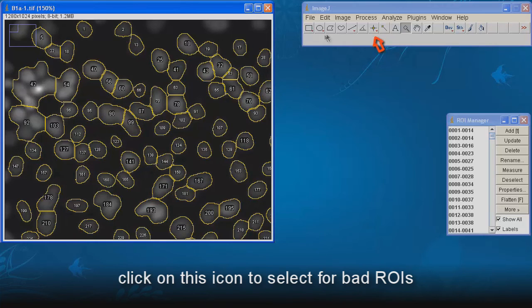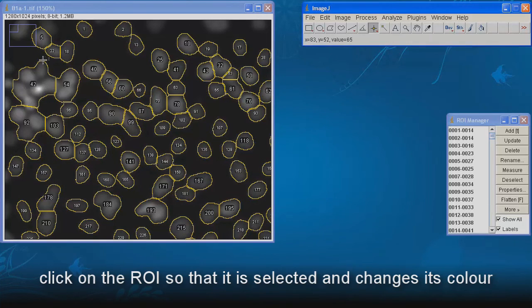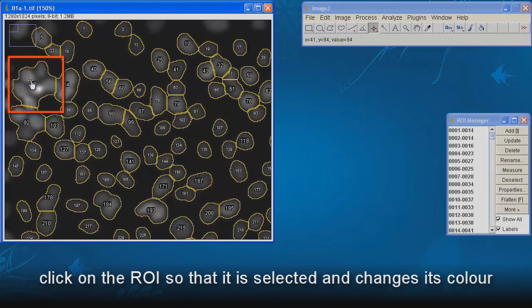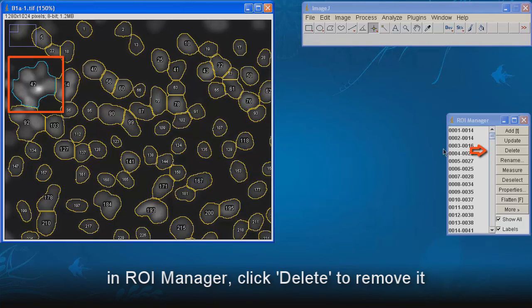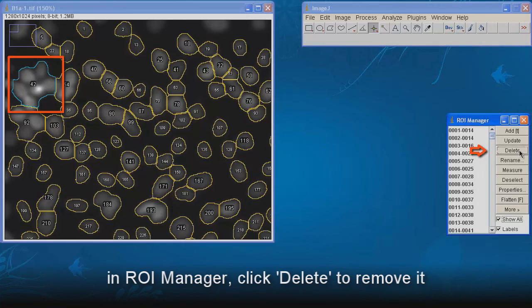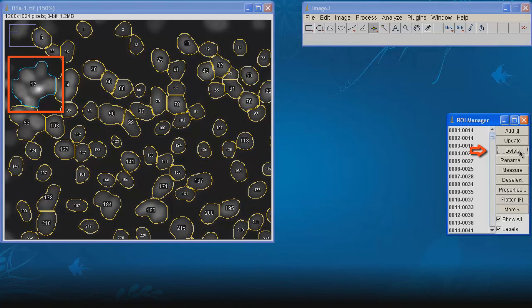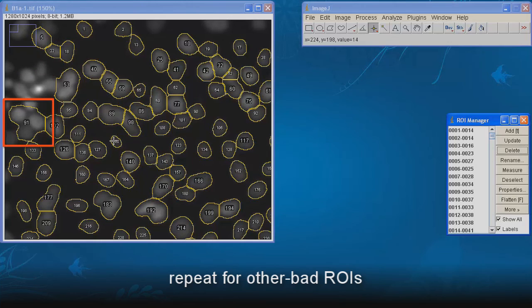Click on this icon to select for bad ROI. Click on the ROI so that it is selected and changes its color. In ROI manager, click Delete to remove it. Repeat for other bad ROI.